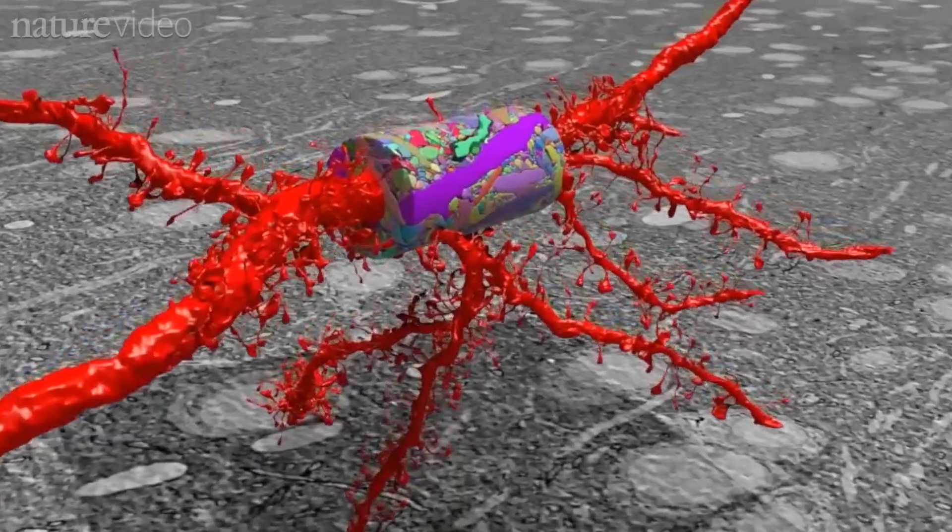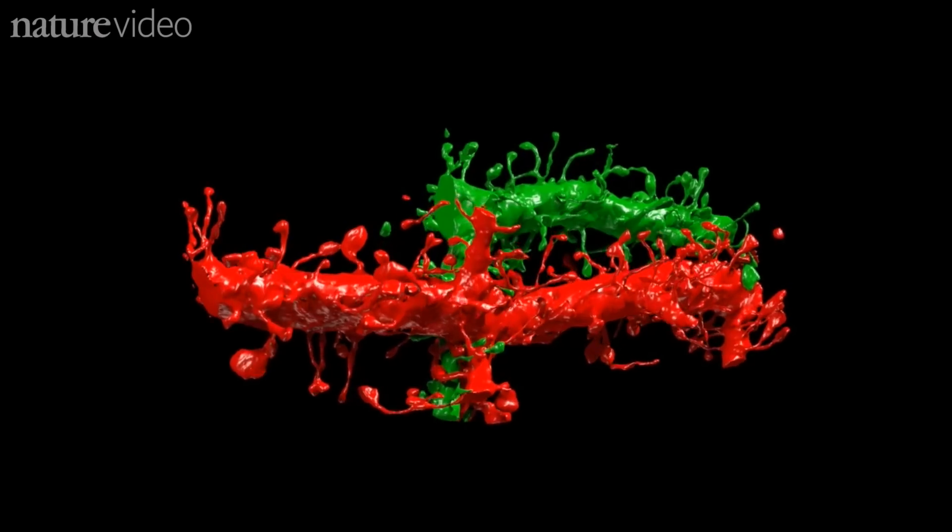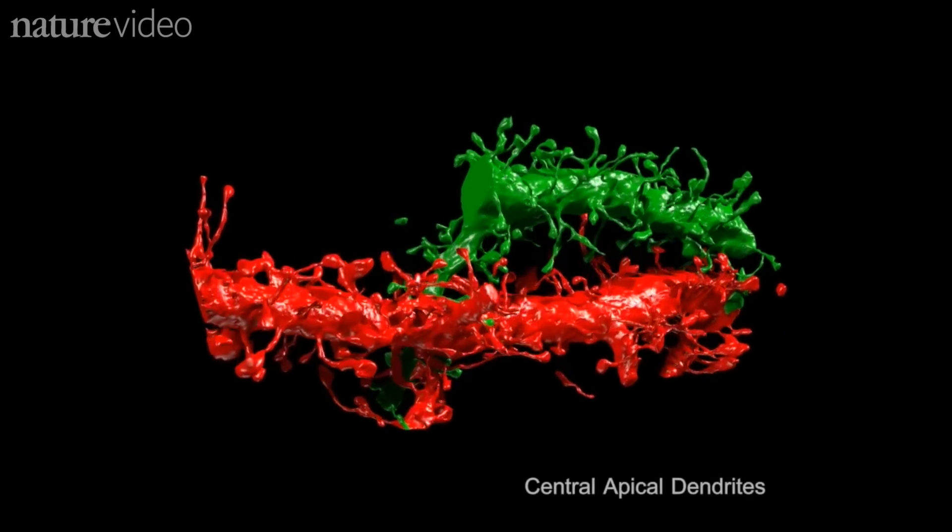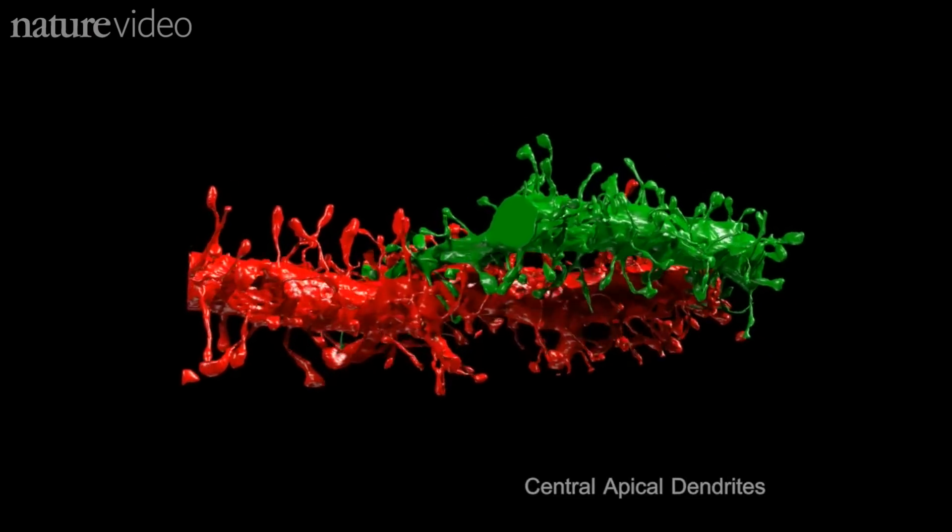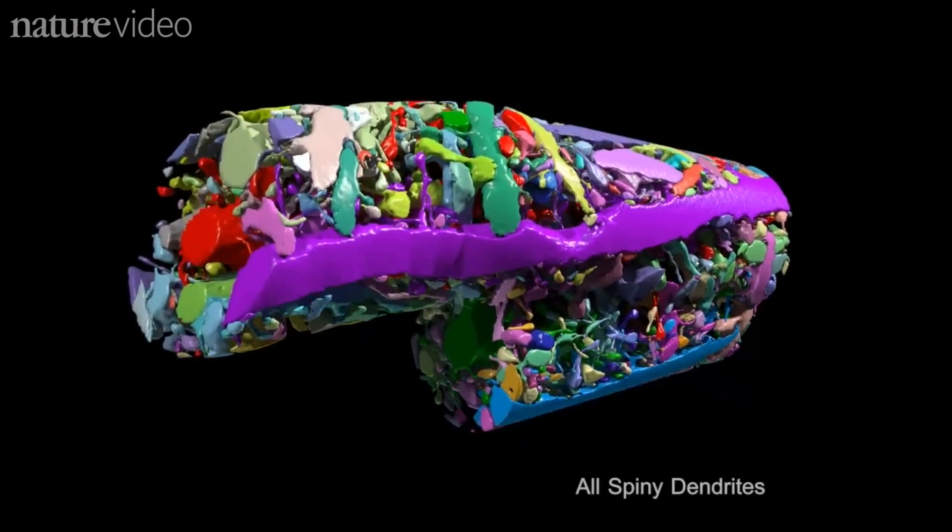They focused on two brain cell branches that interact in this portion. You can start to make out the components here. In red and green, the two main cell branches. Then, all the other neurons that travel through the area at some point.